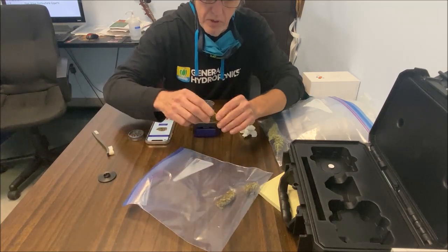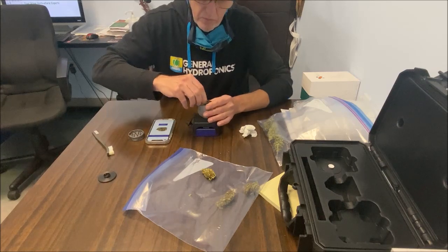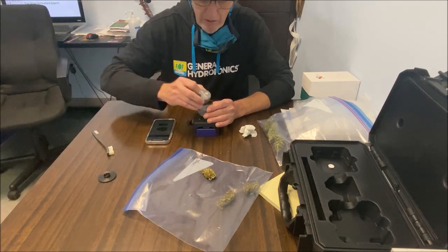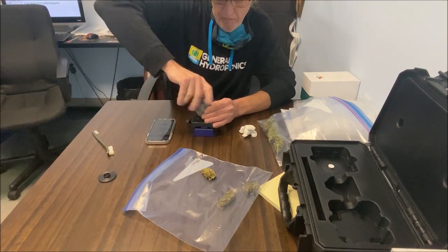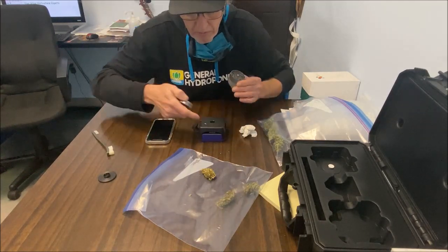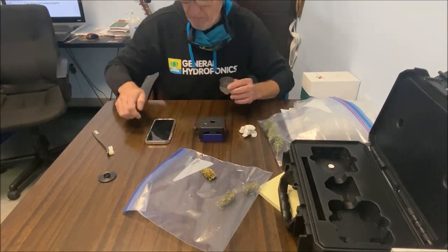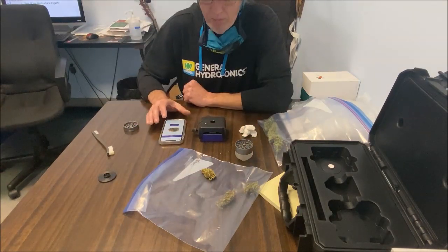I'm just going to take the top off of that bud, and you can see it's probably not even enough to roll a joint, but it's enough to fill the hopper down here and to do a test. So I just put it in the grinder. I'm going to grind it up. Okay, so I've got the reservoirs filled. I tamp it down with the tamper, and then we bring up the app. Okay, we're ready to go.